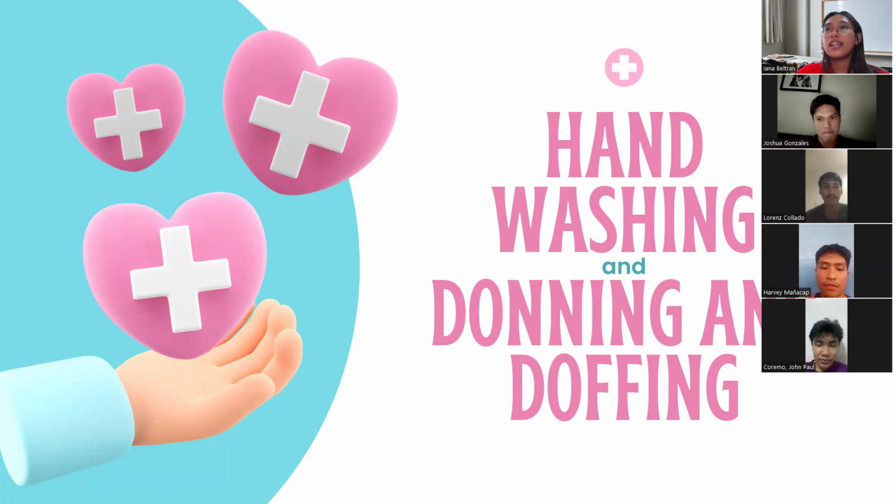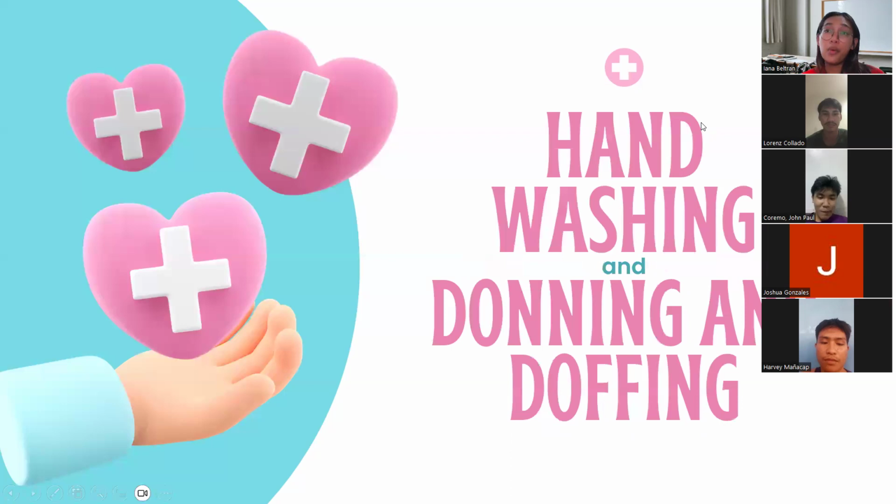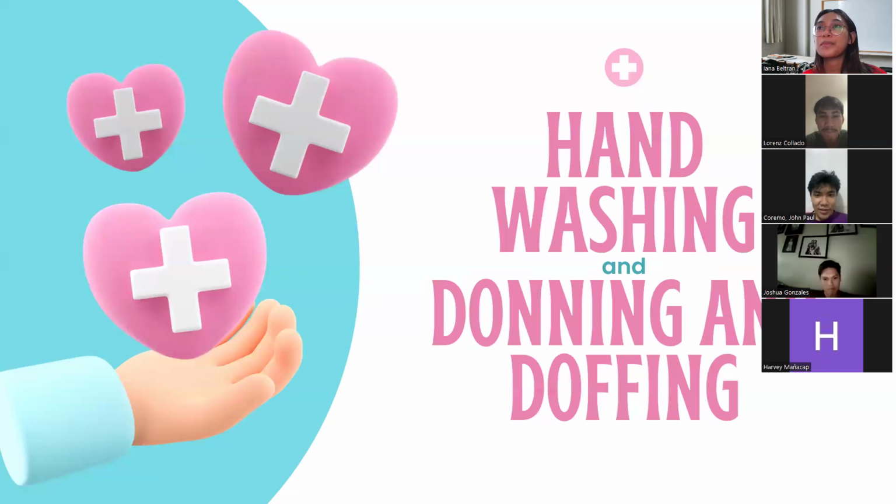So before we start, have any of you encountered hand washing and donning and doffing? Yes, ma'am. Okay. Yes, Mr. Coremo, you answered yes. Do you know when we need to wash our hands in the laboratory setting? If we collect blood. Okay, that is correct. When we are collecting blood, we also need to wash our hands for safety purposes.